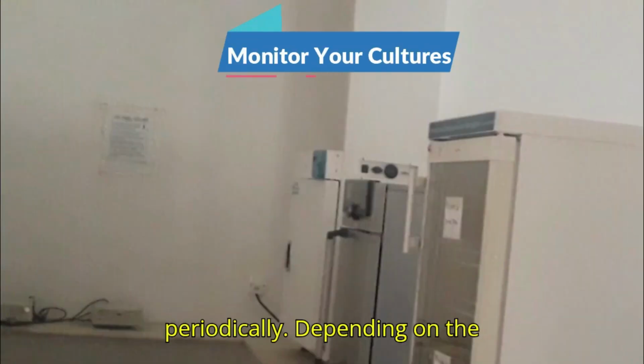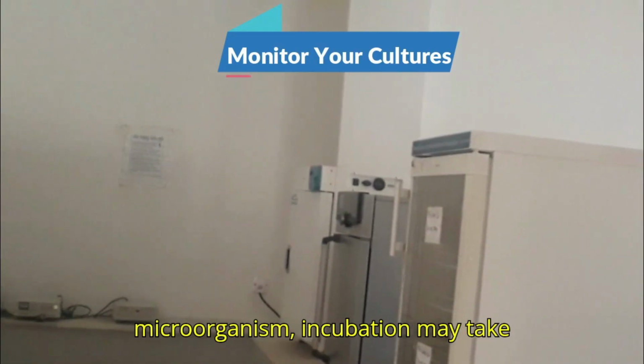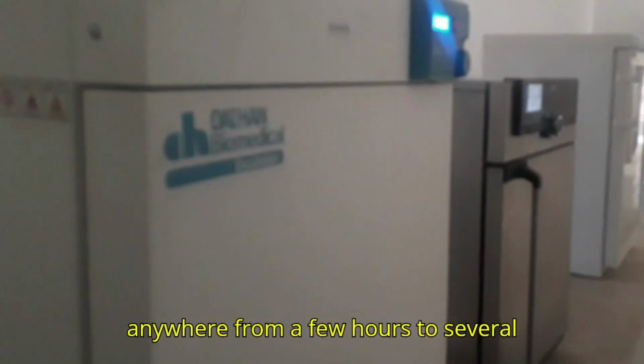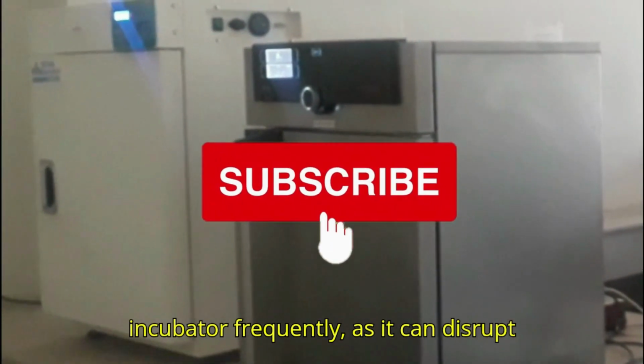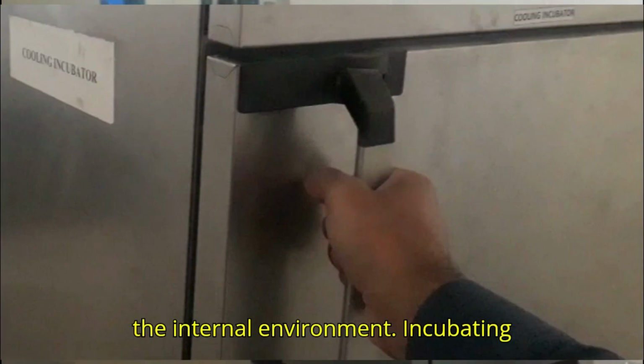Check on your samples periodically. Depending on the microorganism, incubation may take anywhere from a few hours to several days. Be patient and avoid opening the incubator frequently, as it can disrupt the internal environment.